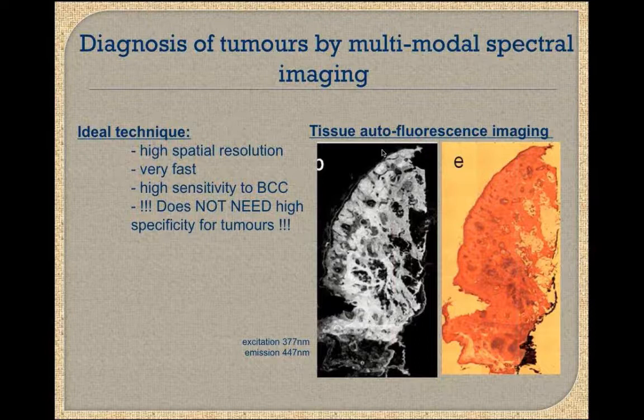So in other words, instead of using raster scanning, which is a very inefficient method, we wanted to try to identify the main regions of interest in the tissue and then use Raman spectroscopy just to provide the classification, the diagnosis. So how can we achieve this? We looked at several techniques, and we have got papers published. People who are interested can check.